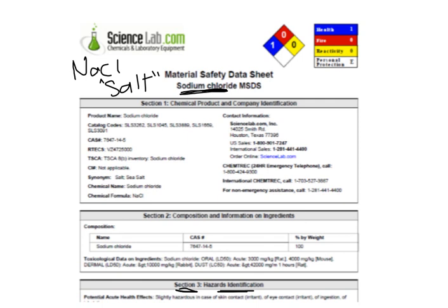And so you could go through this whole thing, and there's 13 parts to them. It talks about what to do if you spill it. It talks about whether or not it causes cancer. It talks about what to do if it ends up in a lake or a stream. Okay. Here's what I need you guys to know.